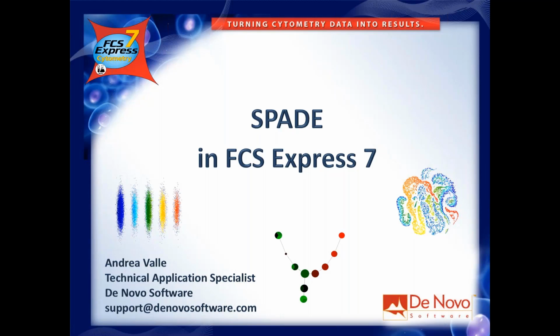It's really straightforward. So probably the main effort for you today will be to go more in depth on how SPADE works. That's the only way in which we'll really be able to manage the SPADE results and analyze them in a critical way.